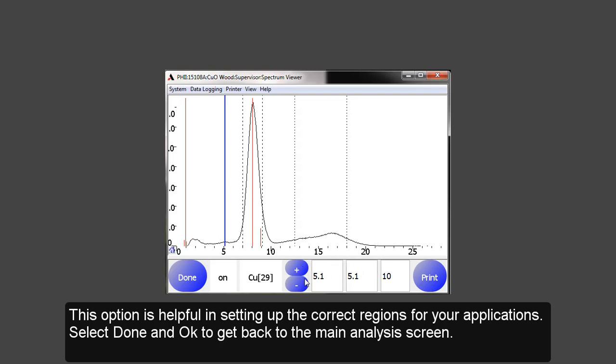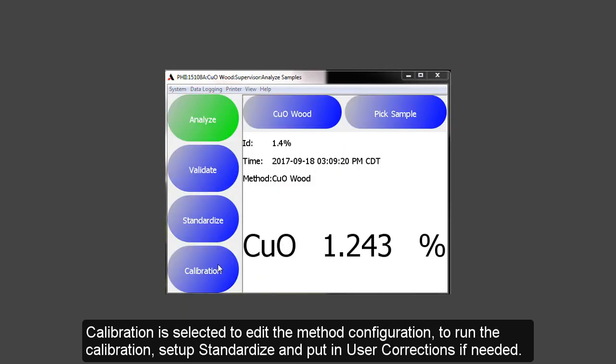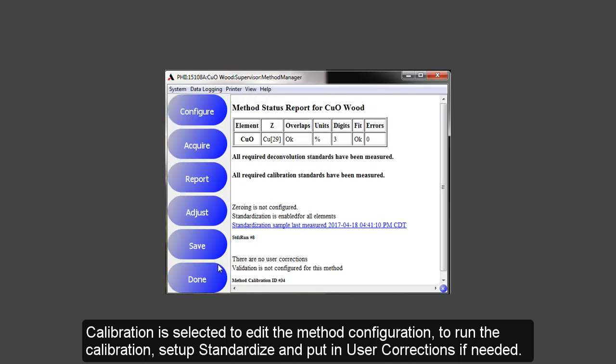Selecting Done and OK will get you back to the main analysis screen. Calibration is selected to edit the method configuration, to run the calibration, set up standards, or put in user corrections if needed.